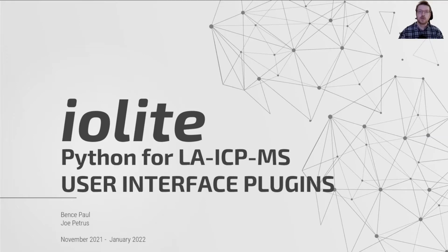This week we are talking about user interface or UI plugins. UI plugins are easily my favorite thing about iolite's Python integration because you can do so many different and interesting things. So let's dive in and see if you agree.